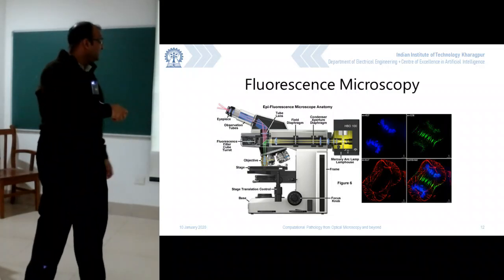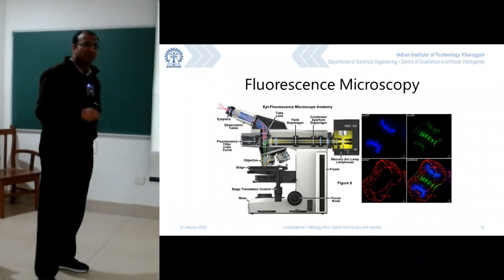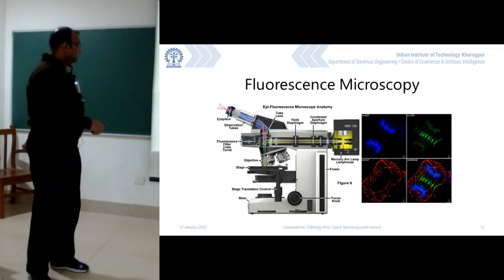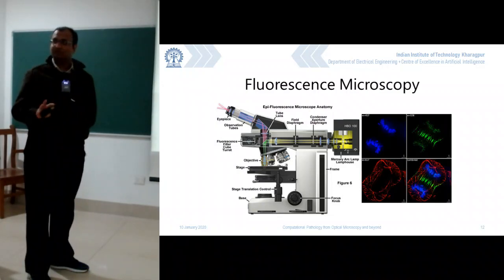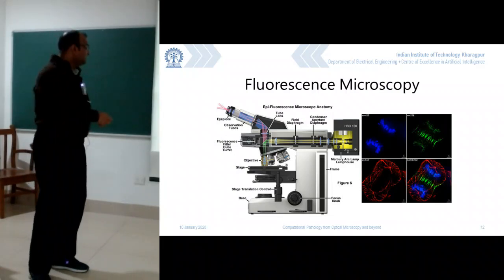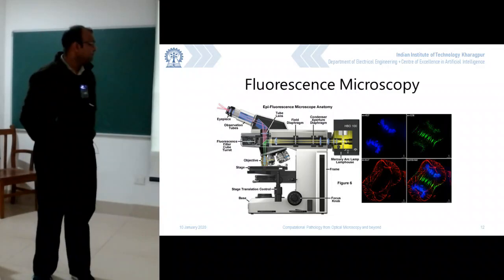This is about how that particular microscope works, and typically any fluorescence microscope will have a reflected mode. It does not work in a transmitted mode, the reason being that you cannot have this kind of bigger, bulky setup placed closed over here. There are some exceptions, people build their own transmission fluorescence microscopy as well, but in general a commercial one will always be a reflected fluorescence microscopy system.